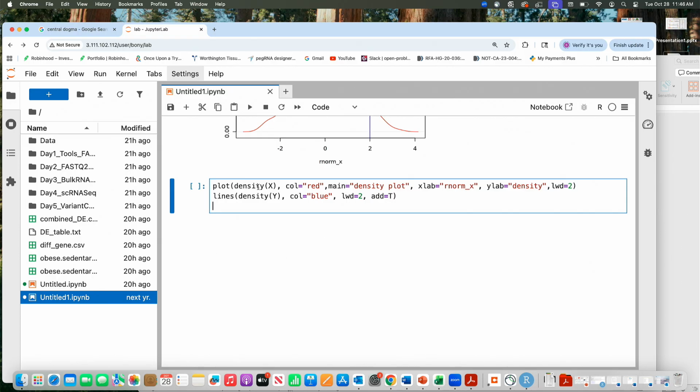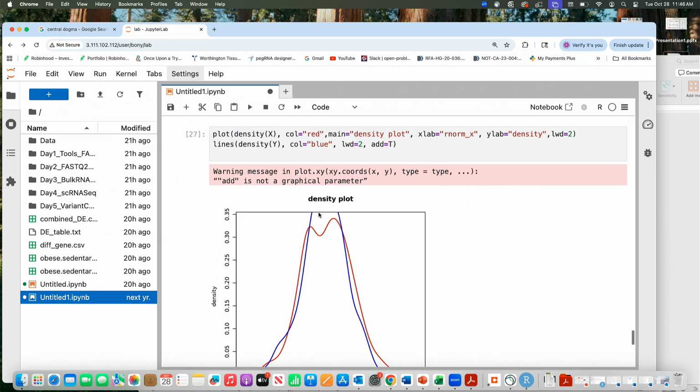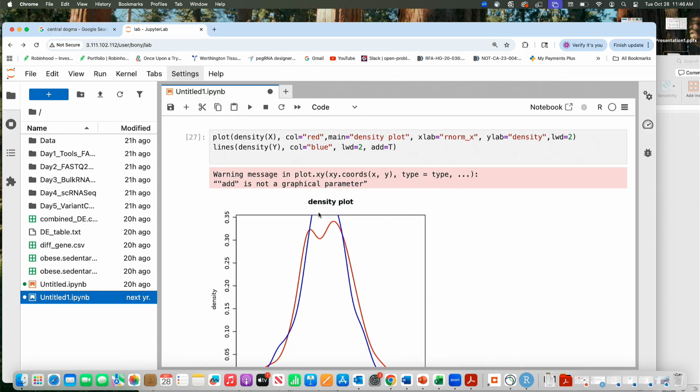But sometimes this gives a warning, and I don't know whether we are going to get a warning this time. Okay, we got a warning. But anyway, that is fine. Still, a warning is not an error. There is a difference between warning and error in R. A warning just says, I gave you a warning, don't do it again, and you can still do it and still get a warning. So it doesn't mean anything.